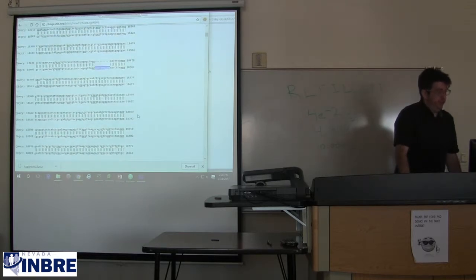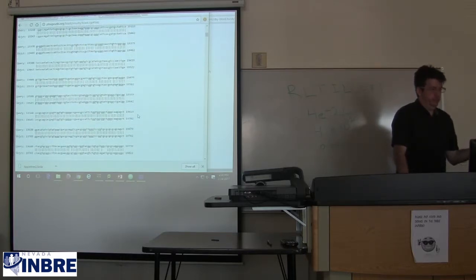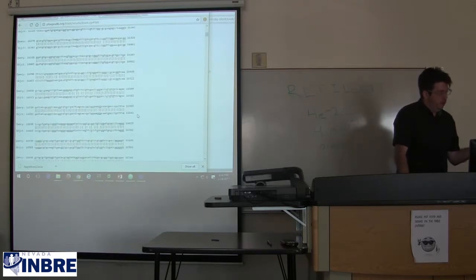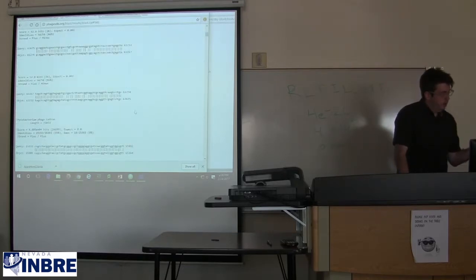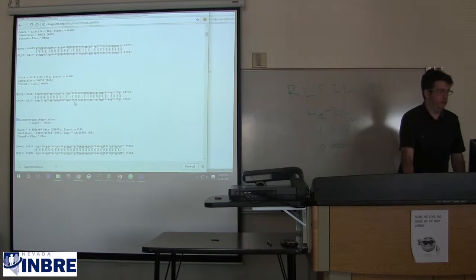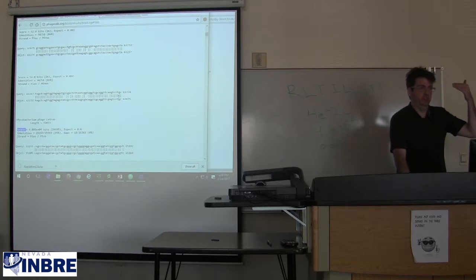So we can see that LeBron is, what we saw in the summary, 99% similar over the 25,000 letters that were being displayed here. Now a little find trick. This is just going to be a find trick, though. We can use the find in our web browser to keep on looking for the additional secondary hits. Because if we remember from the graphical hit table, we saw that LeBron had 3 or 4 regions that were matching.